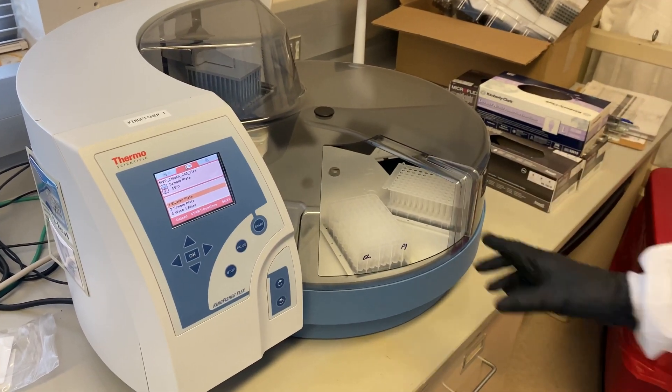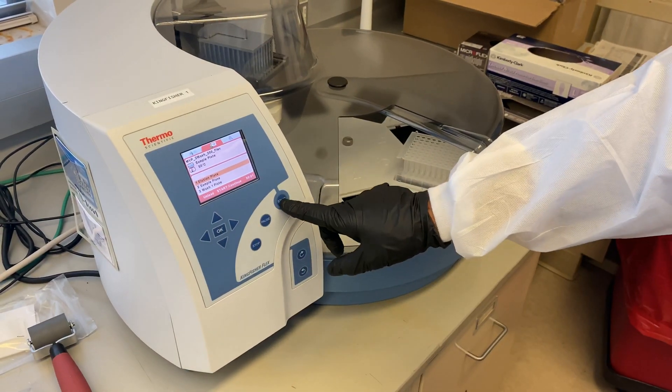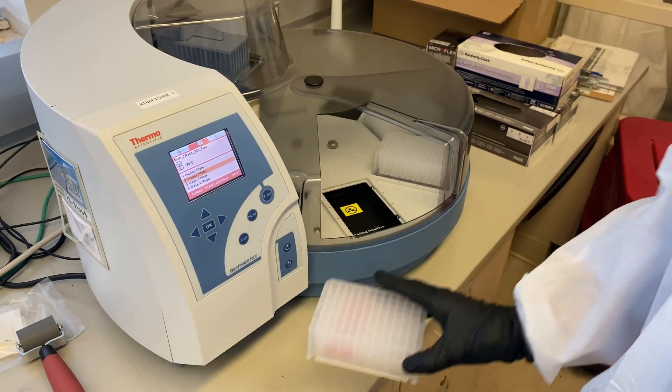When the run is finished, the eluate is removed and taken for PCR. The remaining plates are removed and discarded according to standard lab practices.